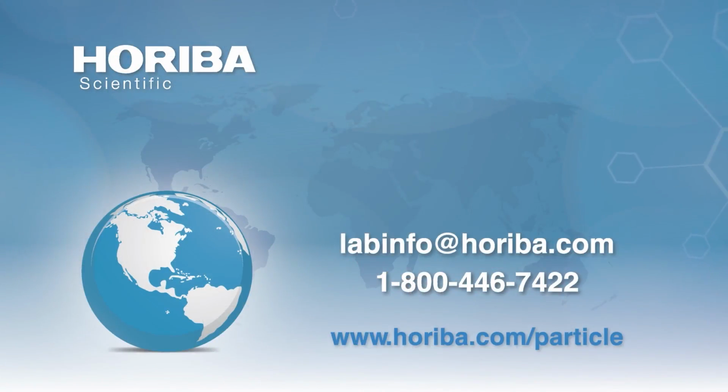Thank you. And this person asked, what is CMP materials? Is it chemical mechanical polishing materials? And in this case, we're looking at silica. Can this technique be used for virus-like particles, full versus empty? Yeah. I mean, CMP is fairly straightforward.